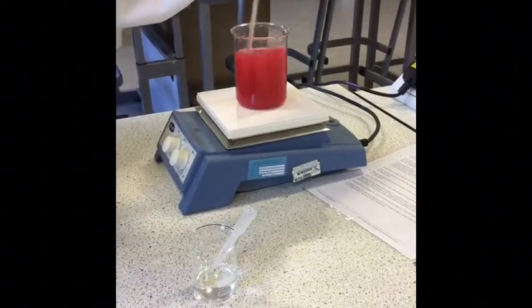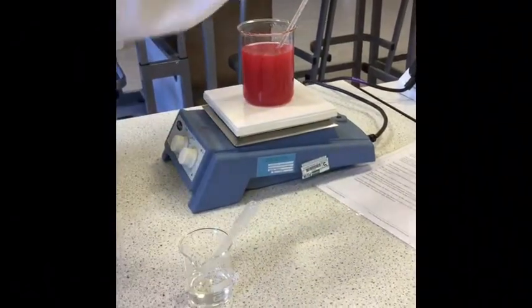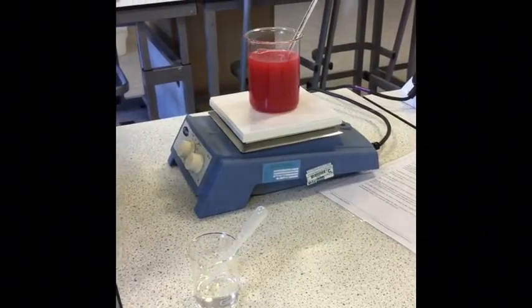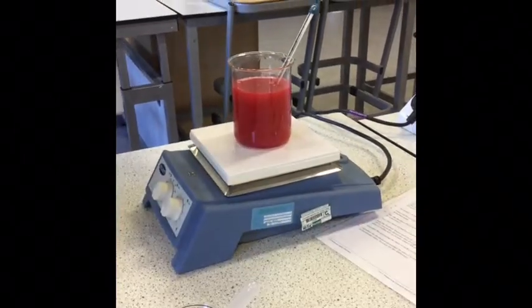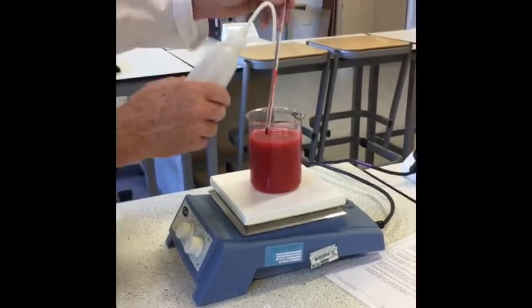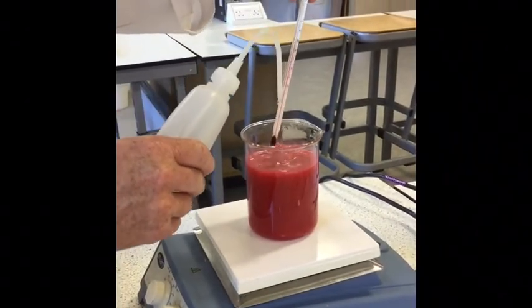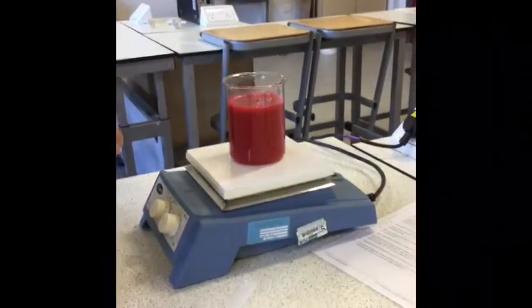The solution should look quite lumpy, with a very obvious solid present in it. Then when you have that, you should add an extra 5 cubic centimetres of the ammonia solution just to make sure. And before you take out the thermometer, make sure you wash it down with distilled water so you don't have any transfer losses, losing any of your complex on the thermometer. Then remove it from the hot plate and leave it to cool down for half an hour.